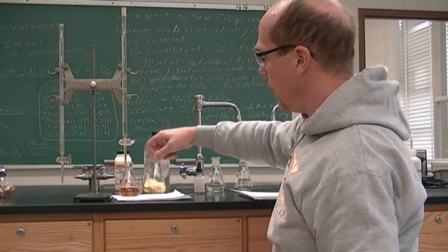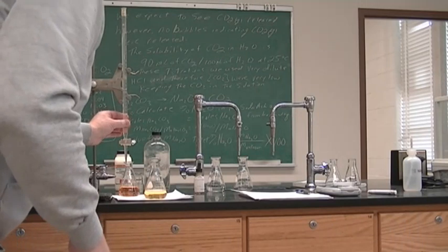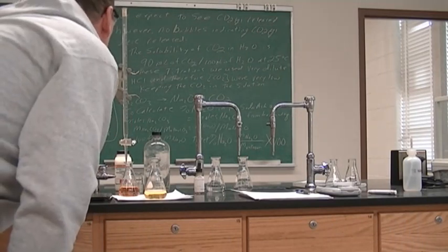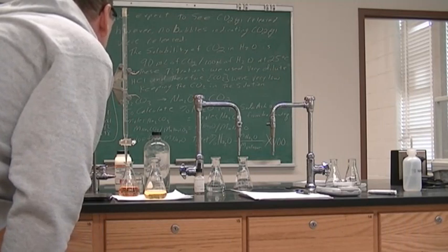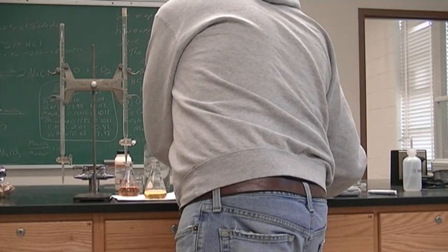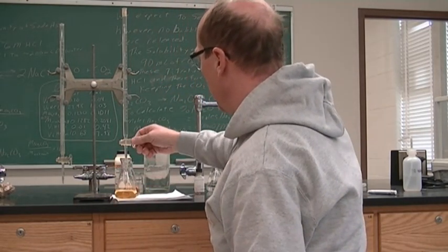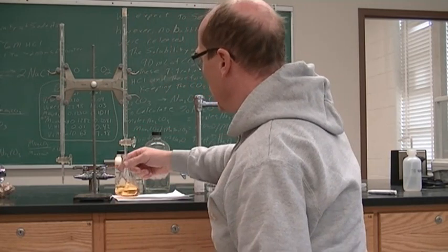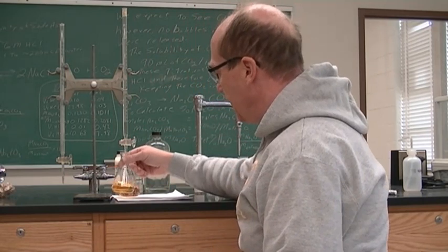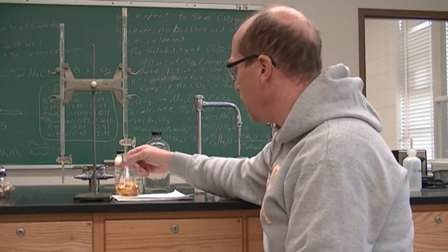And we're going to have a yellow solution. All right, we're going to take our initial volume of our HCl. That is 0.02 mils. All right, so then we're going to add, and we are going to wait for a yellow to an orange peachish endpoint.